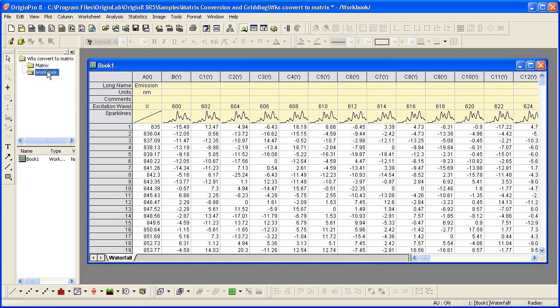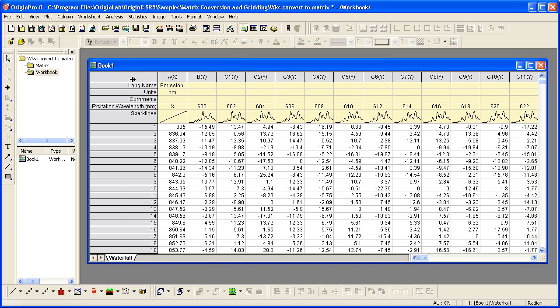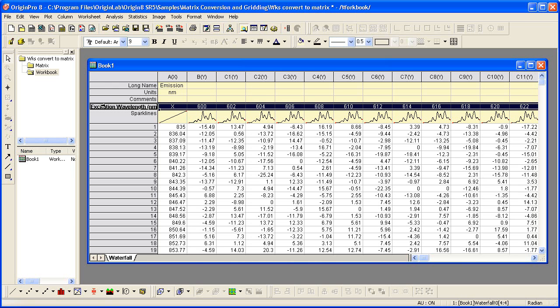We begin with a worksheet that has excitation emission data typical in spectroscopy. The excitation wavelength is stored in a user-defined column label row by that name. A double click on the column label row edge will auto-size so we can read the full name. In this example, it is this row that stores the X values. But your data could have been imported such that the values were in the long name or comments, and that row could have been used as well.